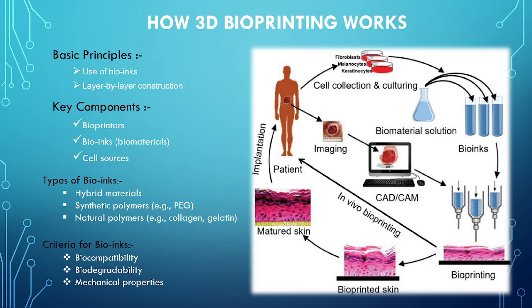Right, now let's think technically about how this printer works, right? I'm not going to approach you from the engineer's perspective. I'm just going to give you a much easier and summarized way for your biomedical science courses, right? Because you have to know these things, since you are also working in the industry, you must be familiar with these technologies, and you must know they exist, so you can recommend someone to provide solutions for these problems as well, right?